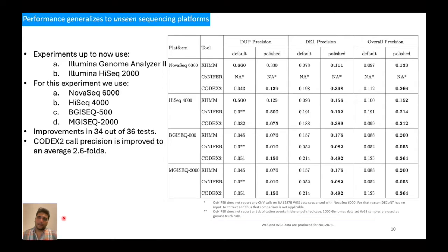As we have already said, we obtained the training dataset from the 1000 Genomes Project database, and the exome sequencing component is produced using Illumina Genome Analyzer 2 and HiSeq 2000. The data from these platforms is abundant and sufficient training data sizes can be met. However, for users using other sequencing platforms, it might not be possible to train DCONT due to lack of matched exome and whole genome samples.